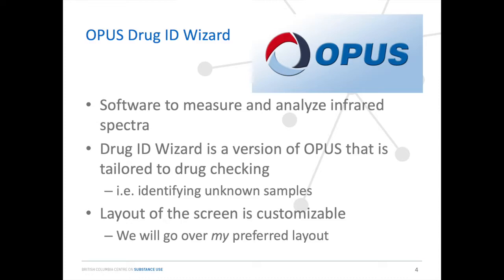If you are using the regular, full OPUS software, the look may be slightly different, but the general functions are the same. I should also note that the layout of the screen is customizable and may differ computer to computer, so it's important to know the functions and where to find them. What you'll see during this webinar is my preferred layout.